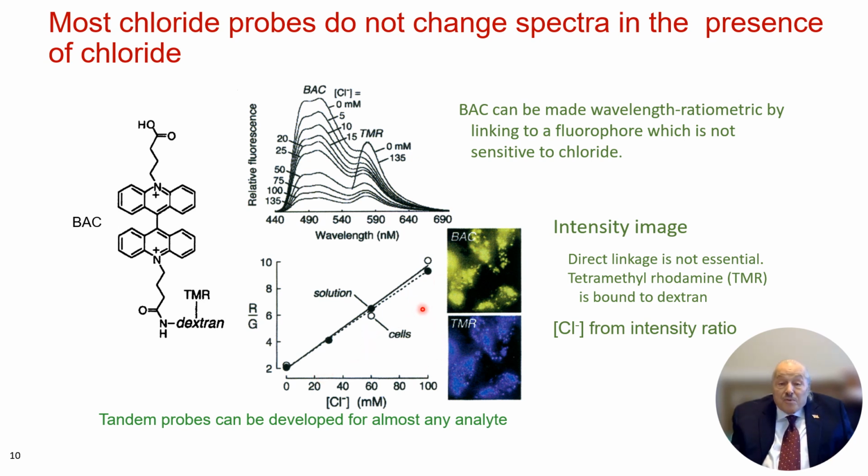So both of these, the previous slide and this one, we would call them tandem probes. You can make tandem probes for almost anything. And as I mentioned, it's bound to dextran.